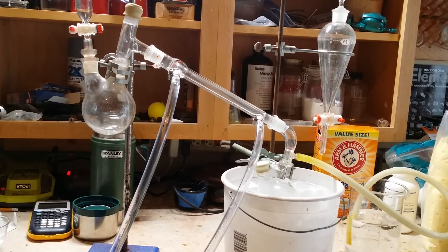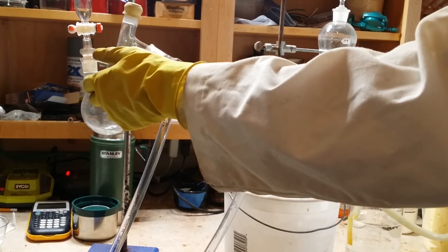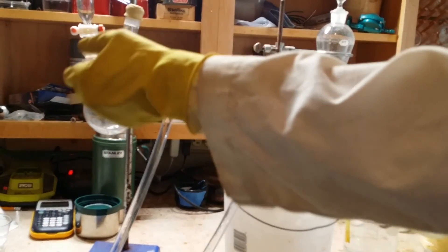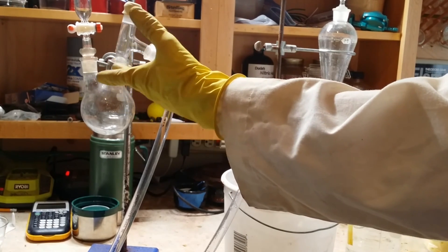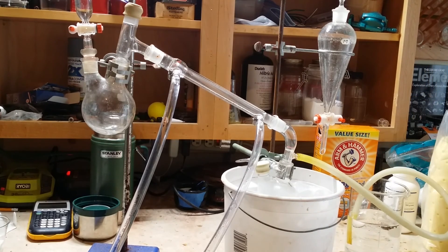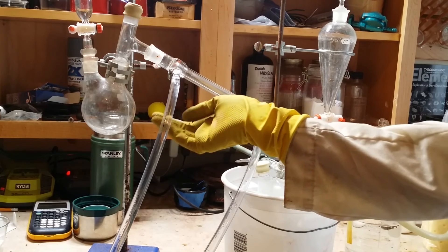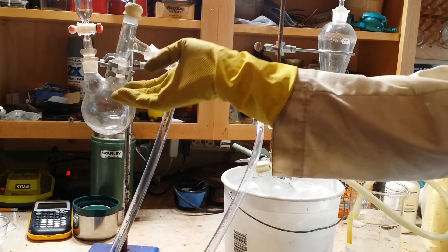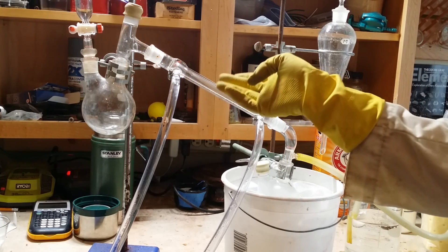Here's the apparatus I'll be using to make the bromine. This is where the actual bromine will be produced; however, it will be mixed with everything else I used to make it, like sulfuric acid, potassium permanganate, water, and things like that. Since bromine has a very low boiling point, it'll evaporate here and has nowhere to go but into this condenser tube.